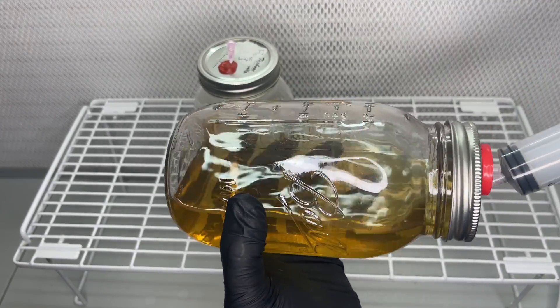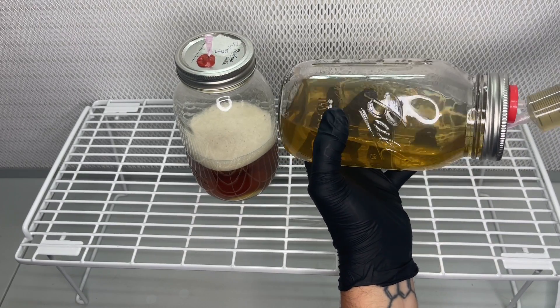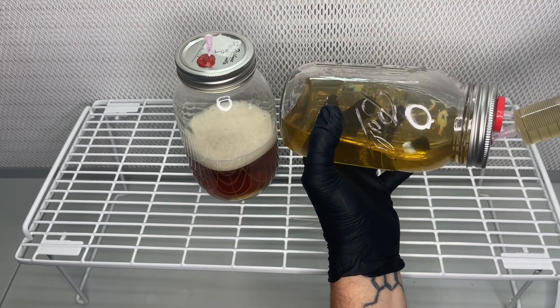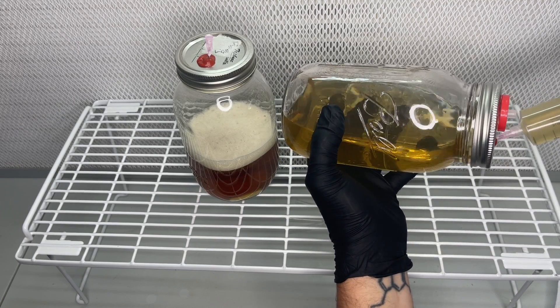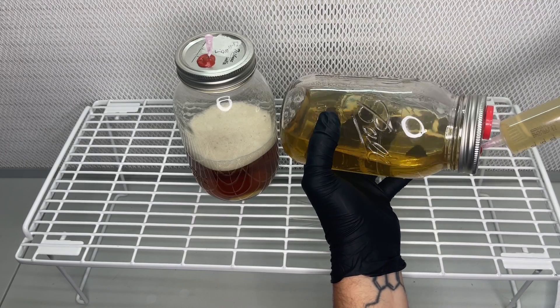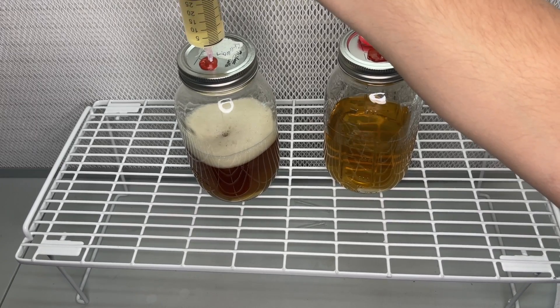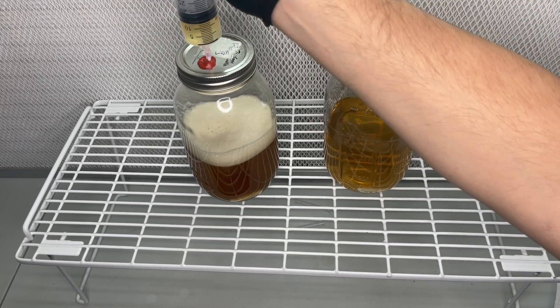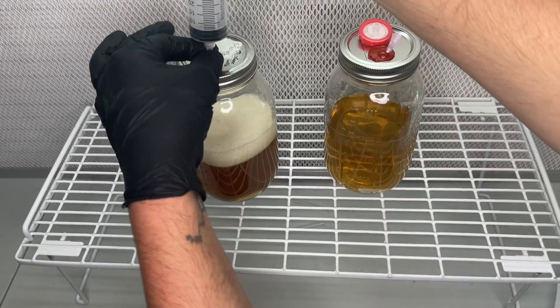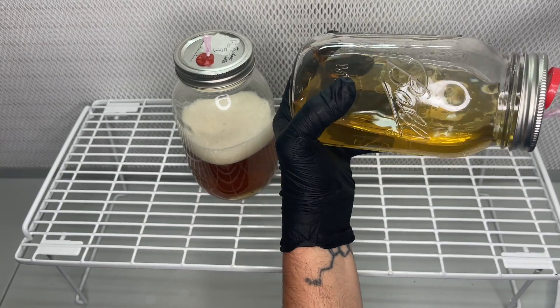The only downside I noticed in this experiment is the difficulty in pulling the syringe barrel back, so I'll probably think of a more efficient way to swap out the liquids if it becomes necessary. In one of my previous videos I built a peristaltic pump system that automatically made syringes for me, so I'm thinking something like that would help in this situation.